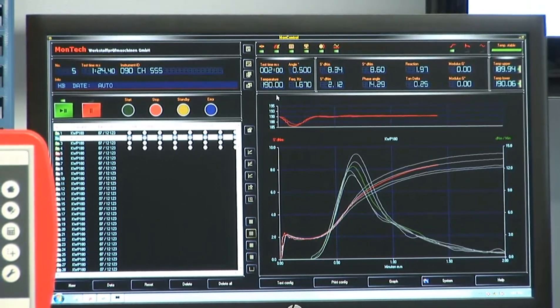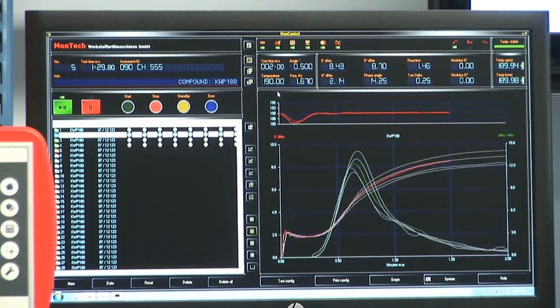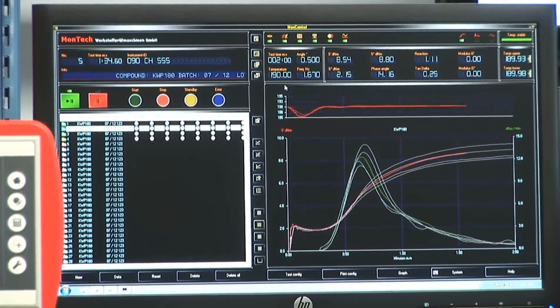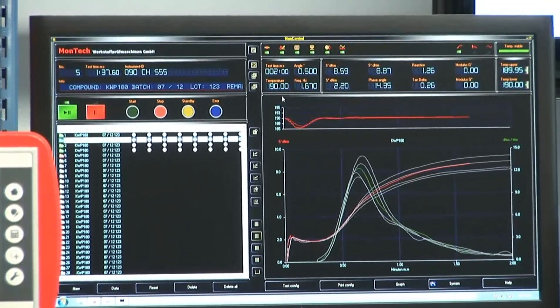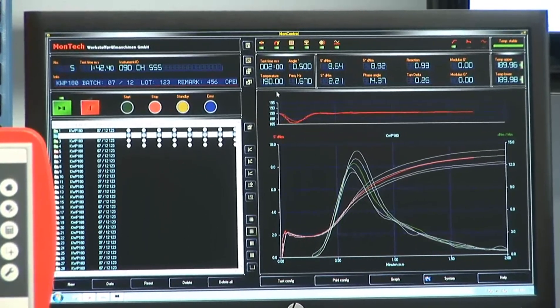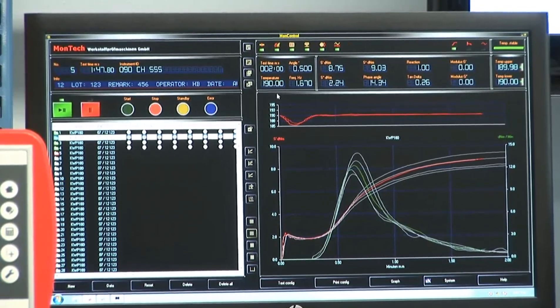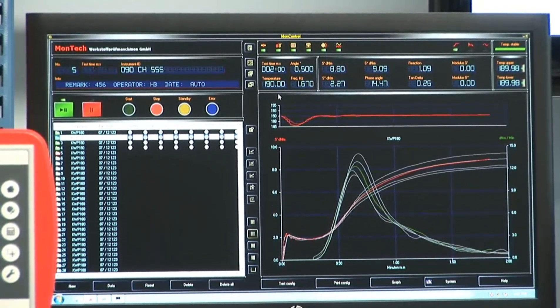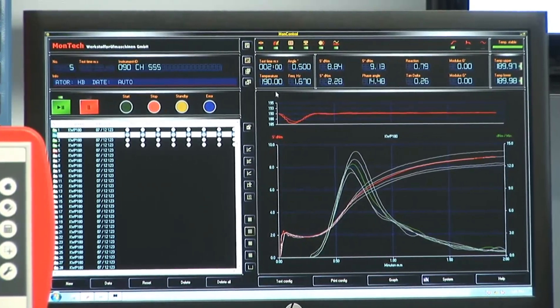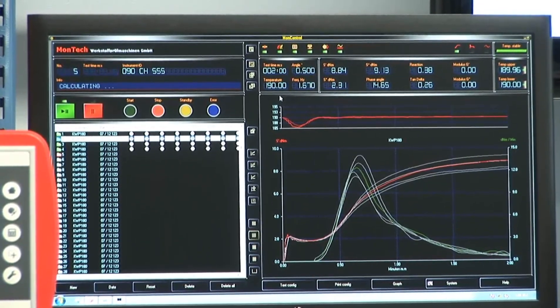The MonControl software can furthermore be installed on office workstations to remotely access the data and monitor test results. It not only features test configuration and data recording, but also a full reporting system to analyze test results, create tolerance control and warning limits, calculate tolerance curves, as well as perform statistical process control and statistical analysis of test data.